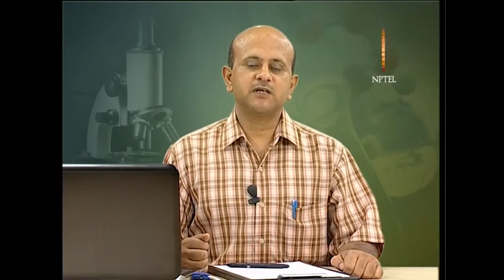It has a conical shape, and when liquid flows from the inlet towards the other end, the velocity will certainly gradually decrease as the diameter of the conical chamber increases. So, the flow velocity will decrease, and we will see what the significance is.